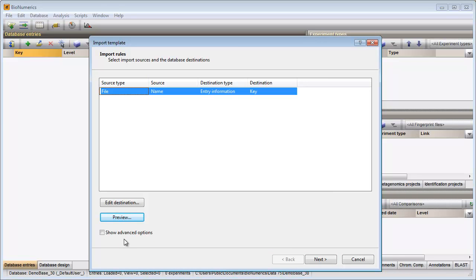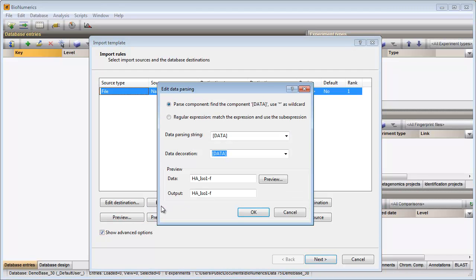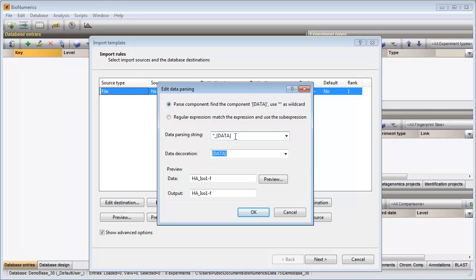I select the option Show advanced options and press the Edit parsing button. In this dialog I need to specify which part of the file name should be retained as key information. This parsing string will omit all text appearing before the underscore and after the hyphen. The correct part of the file names is now linked to the key field.